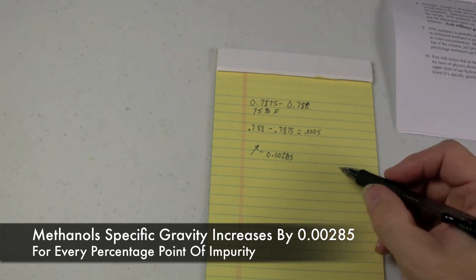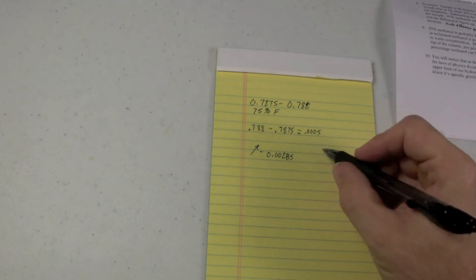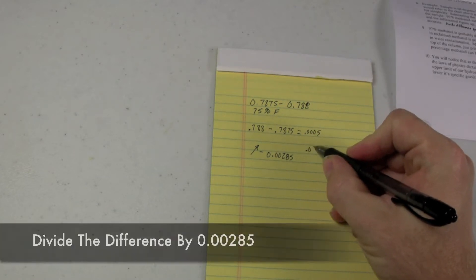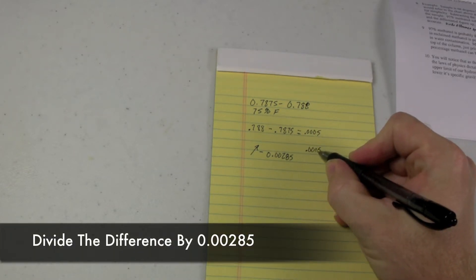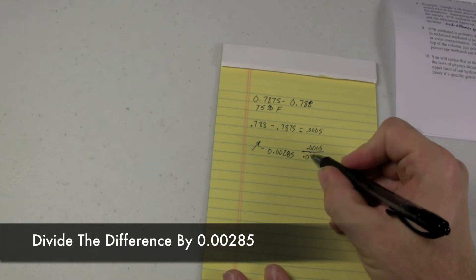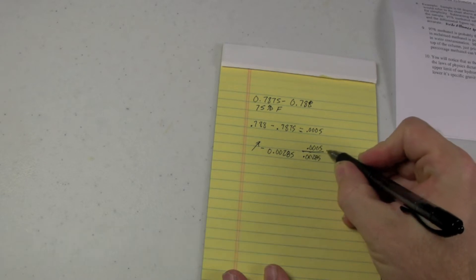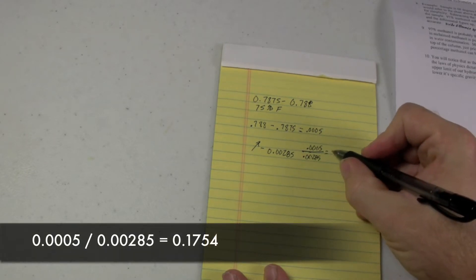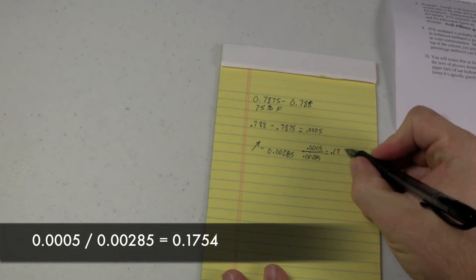So we take, to figure out the purity, we take .0005, which is our reading, and we divide it by .00285. That gives us .1754.